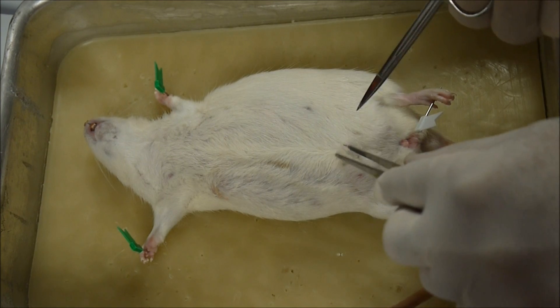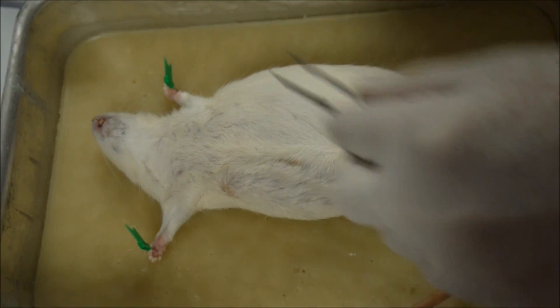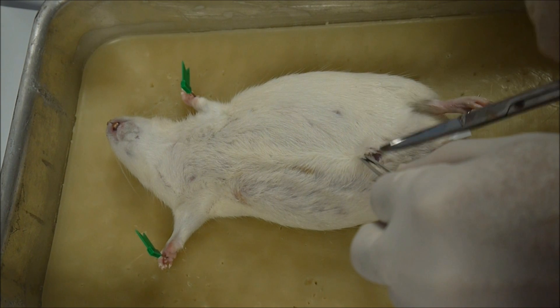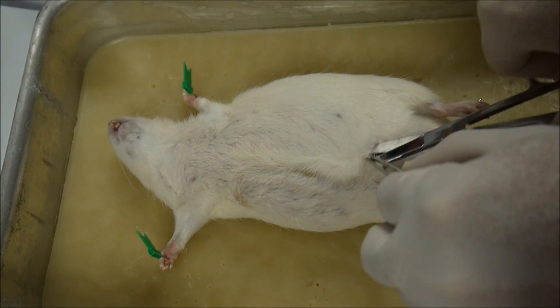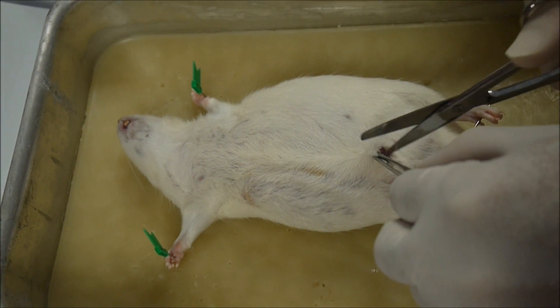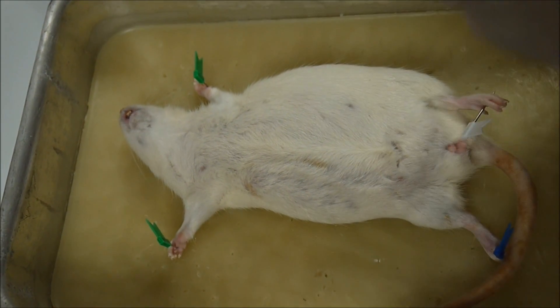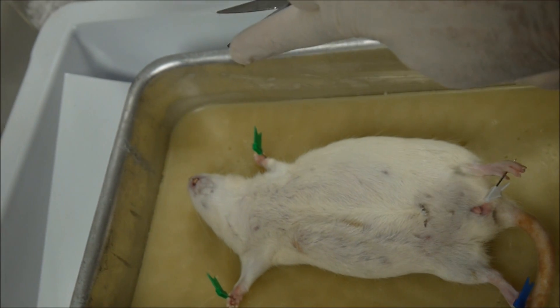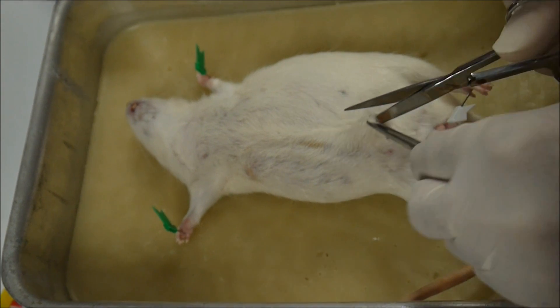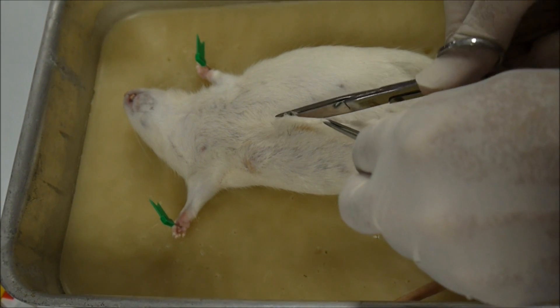Now you make an incision with the fine scissors. Let me get that off there. Then you lift the skin, and I would place the scissors — not cut, but place it under the skin — and just separate the skin from the muscle, so that when you're cutting you are not going to cut the muscle. Notice this scissors has a sharp and a blunt end. Insert the blunt end under the skin because that prevents damage to the muscle. Lift the skin up so you're just cutting the skin and not the muscle underneath it.